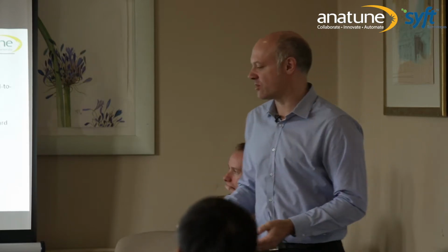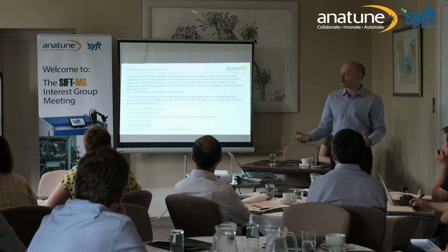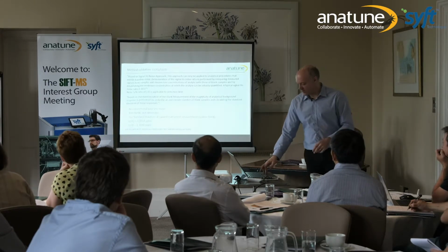And came up with LODs and LOQs of 1 and 4 ppBV, which is so far away from the expected concentrations in this method that it's a nonsense, to be honest with you. But it needs to be done as part of the validation exercise. You need to be able to determine LODs. So the way you do it with SIFT-MS is you just have to define your process for LOD and LOQ and stick to your defined process, because it's going to be slightly more odd than it is for a standard chromatographic method.